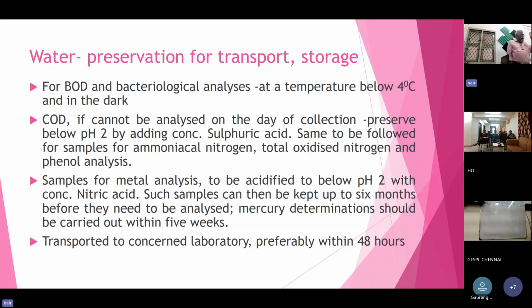A lot of preservation methods are there. You can see them in the Standard Methods for the Examination of Water and Wastewater of the American APHA; the 23rd or 24th edition has come. You will see a lot of preservation methods, but sometimes they may not be practicable. At least do the practicable things, that is what I'm telling. So many are there, but at least do the practicable ones.